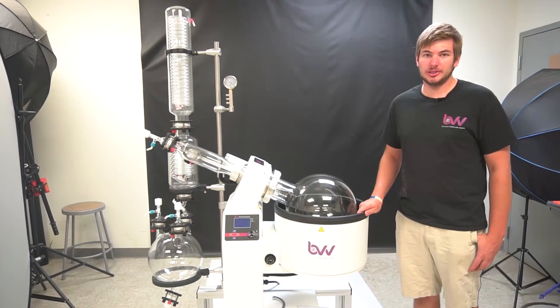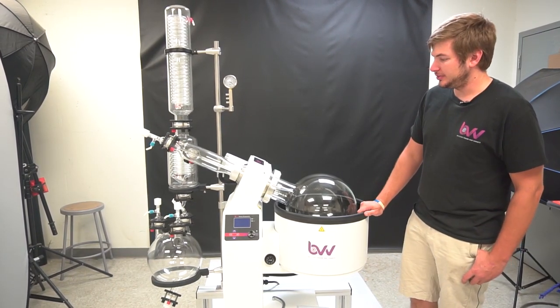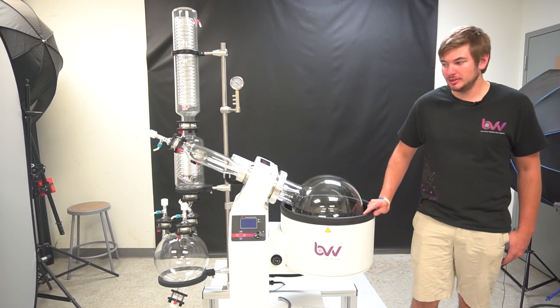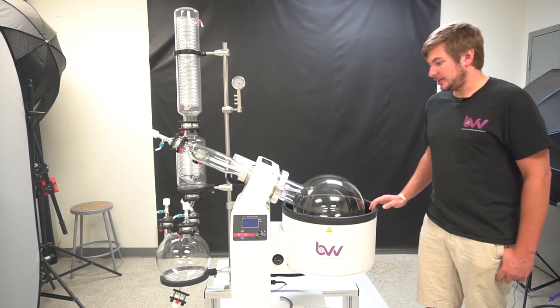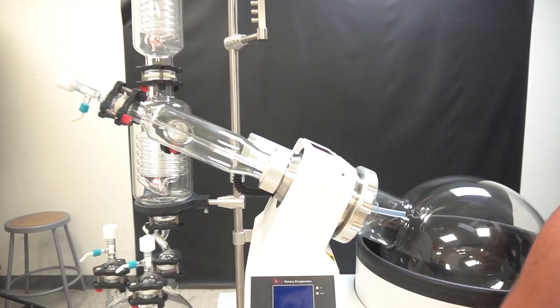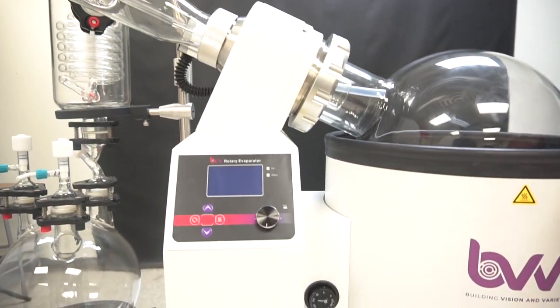Hi everyone. We're here today with our 20-liter Neocision Rotary Evaporator. This unit is tested to UL and CSA certification by ETL. You can see that we have an all-new controller and electrics on the inside. Right here, we have a little safety feature, and this is all part of the UL certification.